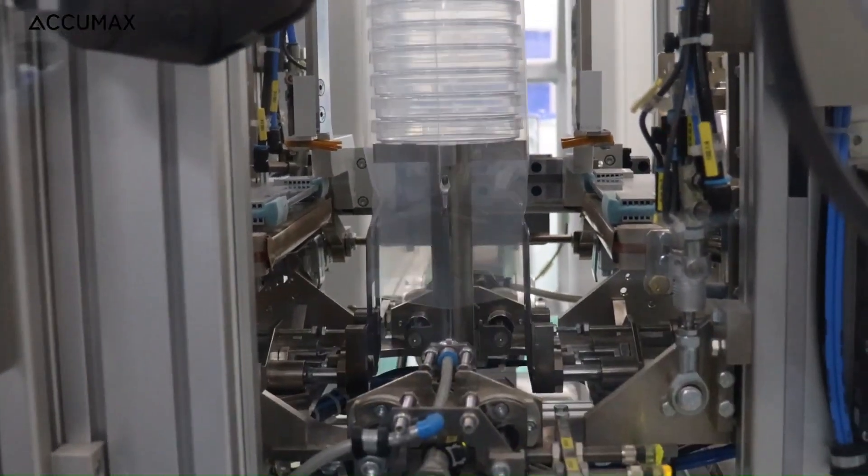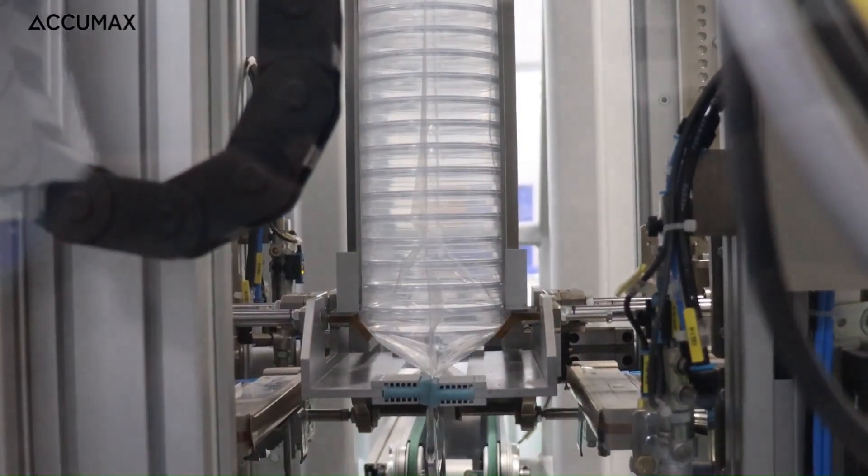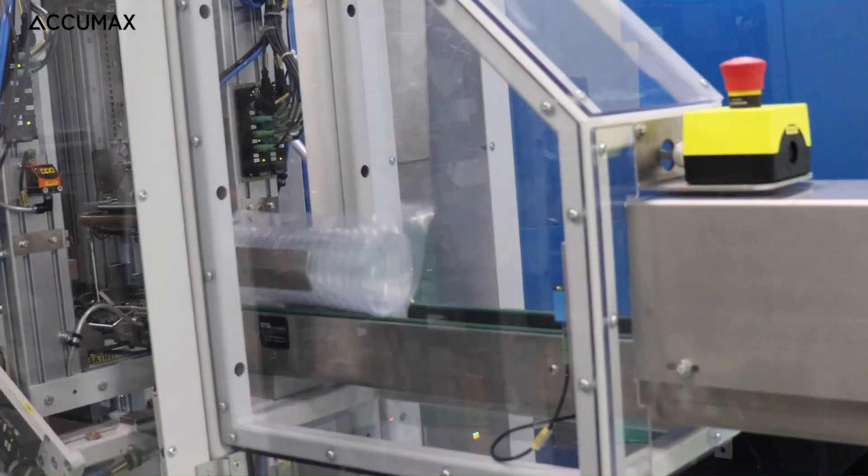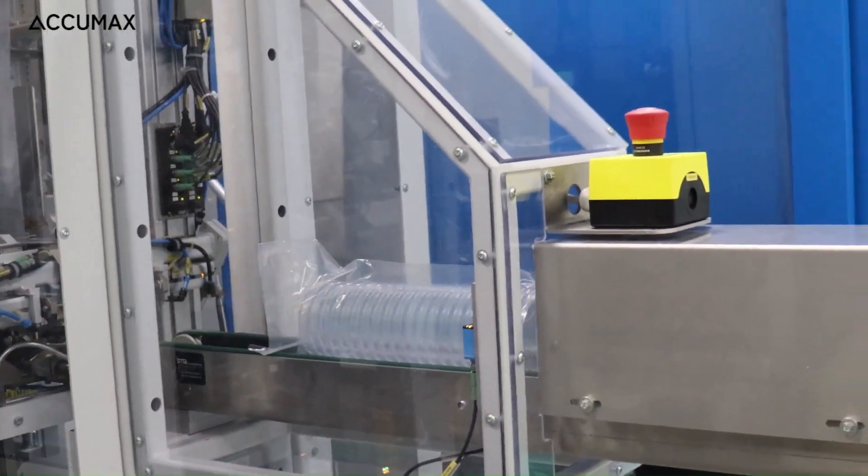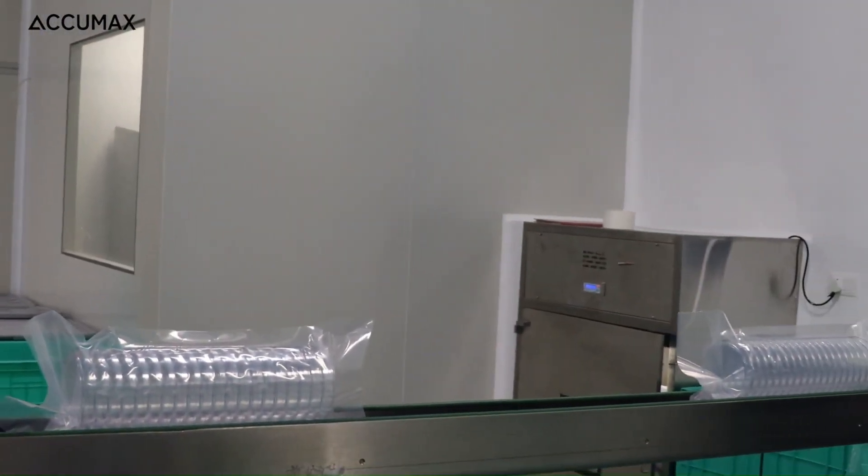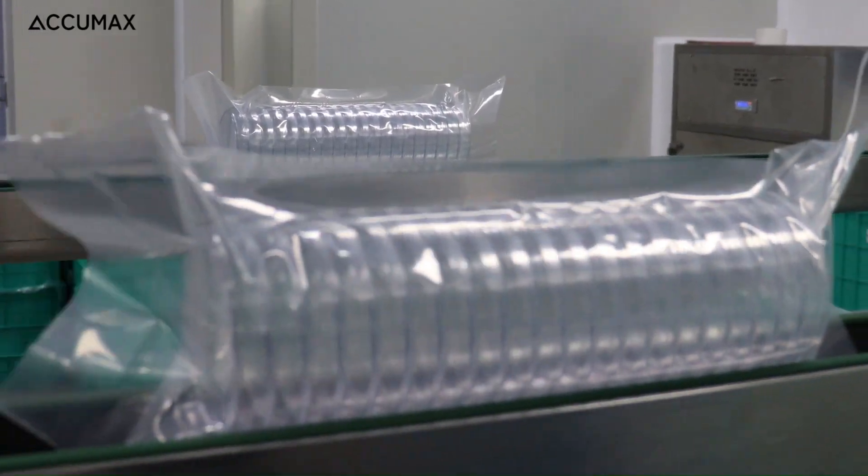Manufactured and packed in fully automated class 10k clean rooms from USFDA 21 CFR compliant polystyrene, Accumax petri plates are available in 90 mm diameter with vented and non-vented variants.